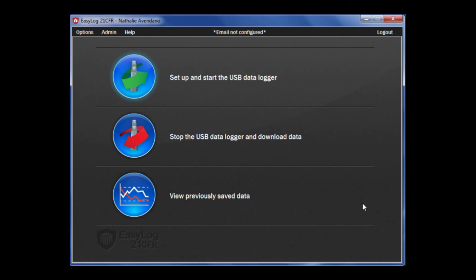Now you can take the data logger out of the USB port and place it in the desired location, as it is ready to start taking data.